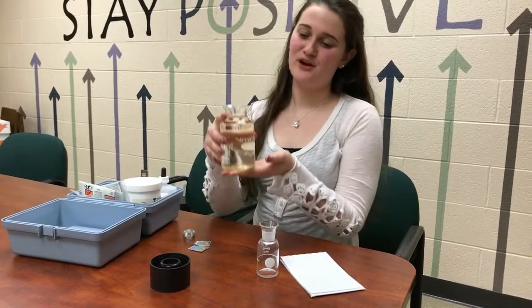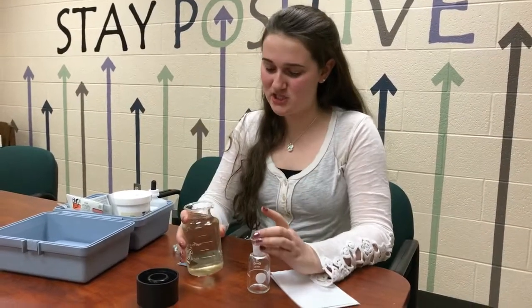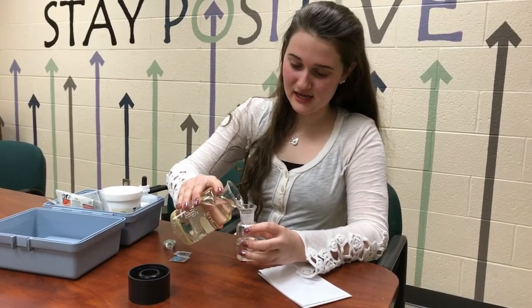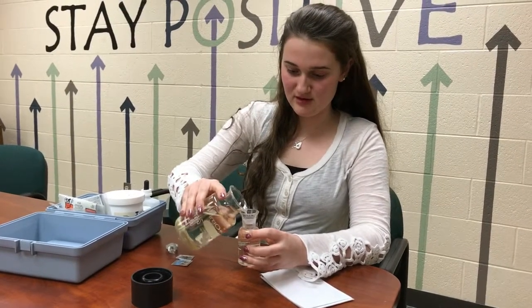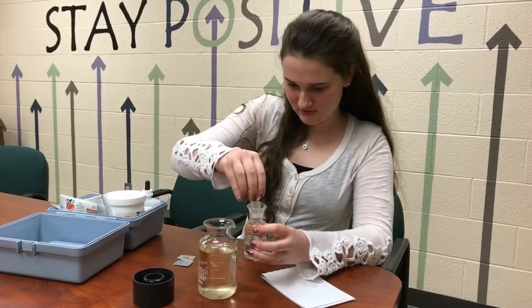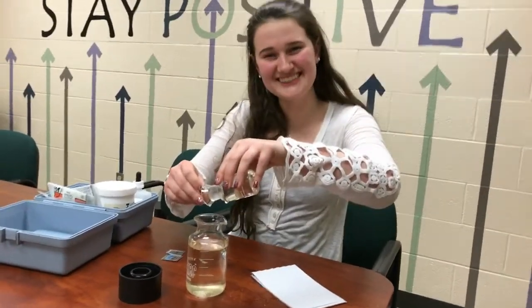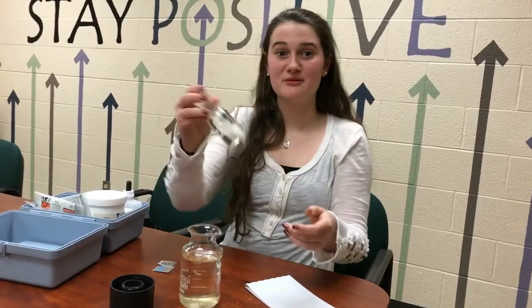Here we have our water sample that is now five days old and ready for the second dissolved oxygen test. The first step is going to be pouring the water into the flask, attempting to get the least amount of air bubbles as possible. Seeing as how we are not in the river it will be a little bit difficult, but we'll try to do the best we can. No air bubbles, so we're good.